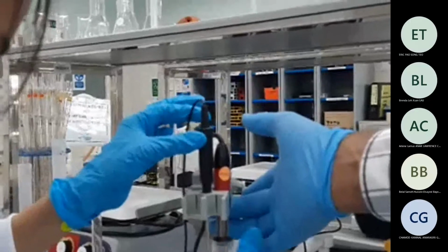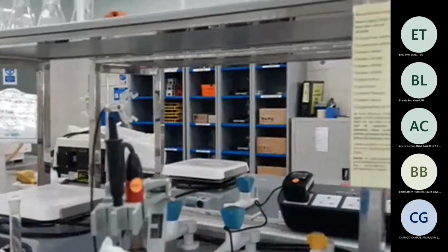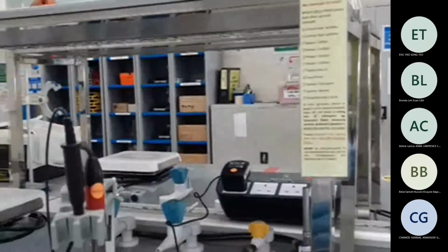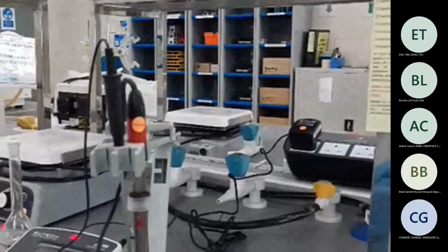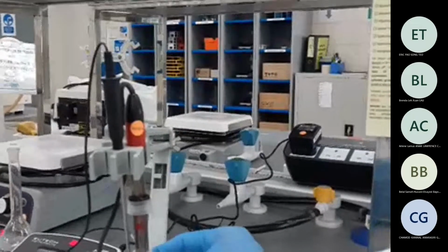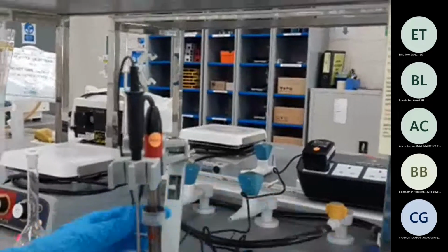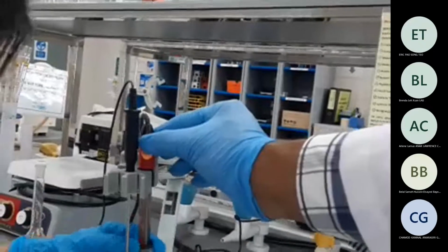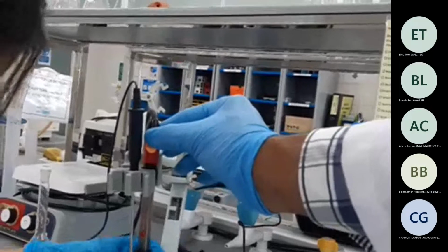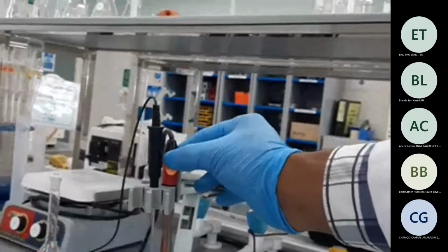I'm coming. Once you have finished your job, please make sure that you put the solution in again, otherwise it will be dry. Remove this thing, and you need to screw these two things together. It will be a bit hard, so slowly bring it down. Bring more. Yeah. Now screw it. Okay, good. Thank you. So just leave it like that because we will need it later on.